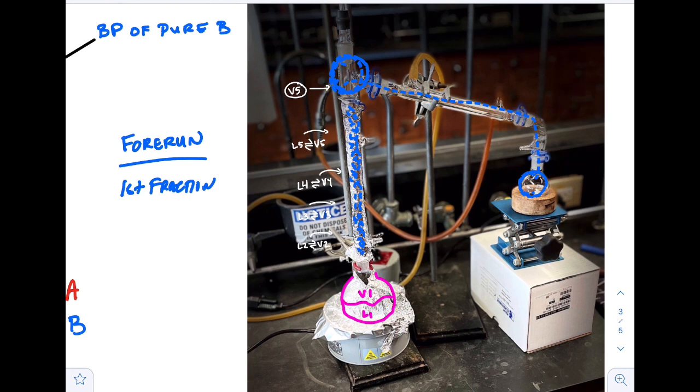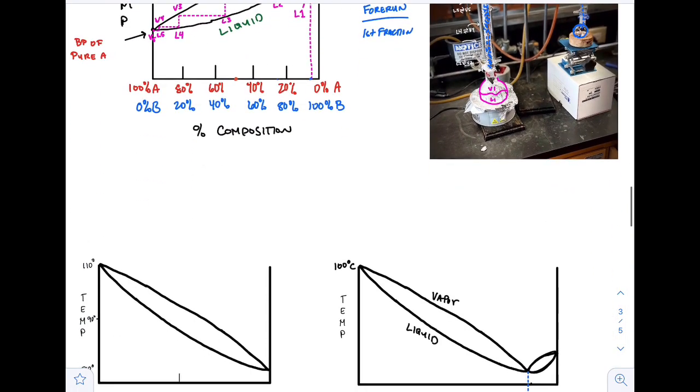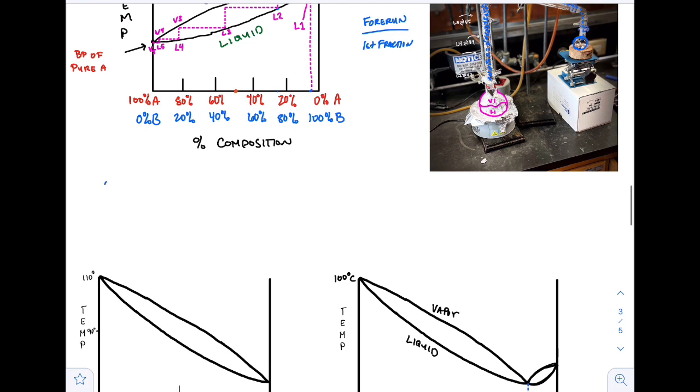But the next thing I wanted to mention is the fact that these five distillations, right? This would be considered theoretical plates. So let me write that. If you're reading about some different columns or distillation methods or whatever, you might see the phrase theoretical plates, and it could be like 1,000 or whatever, but it could be 5 or 2.